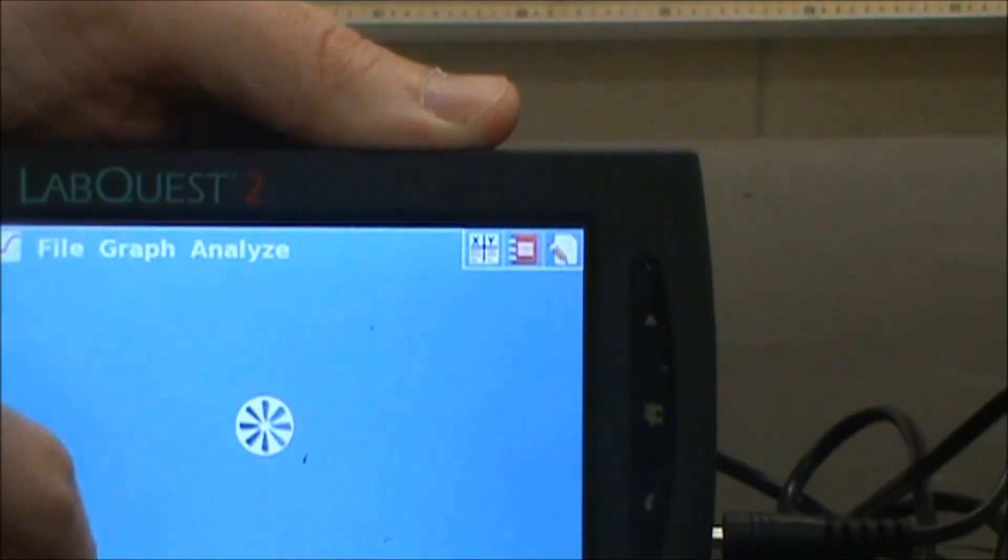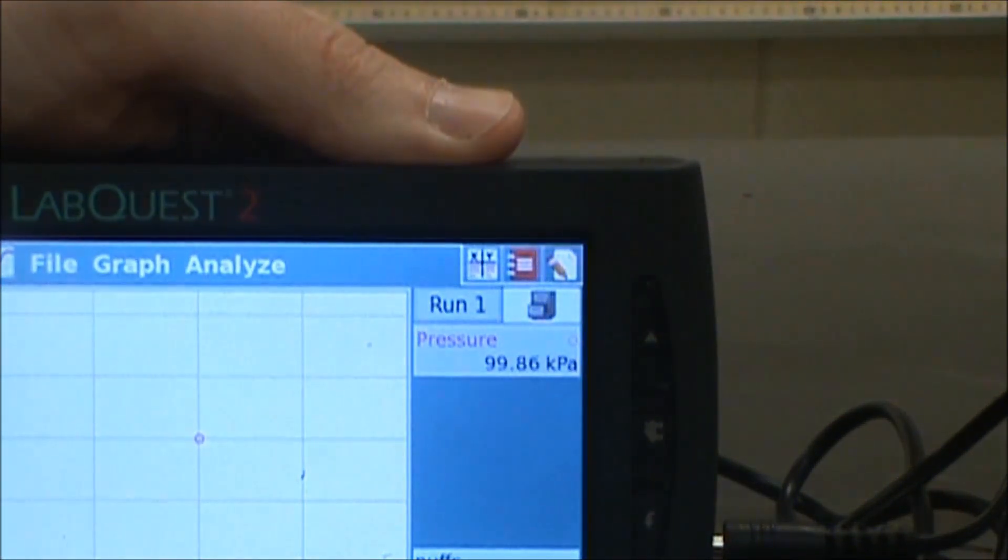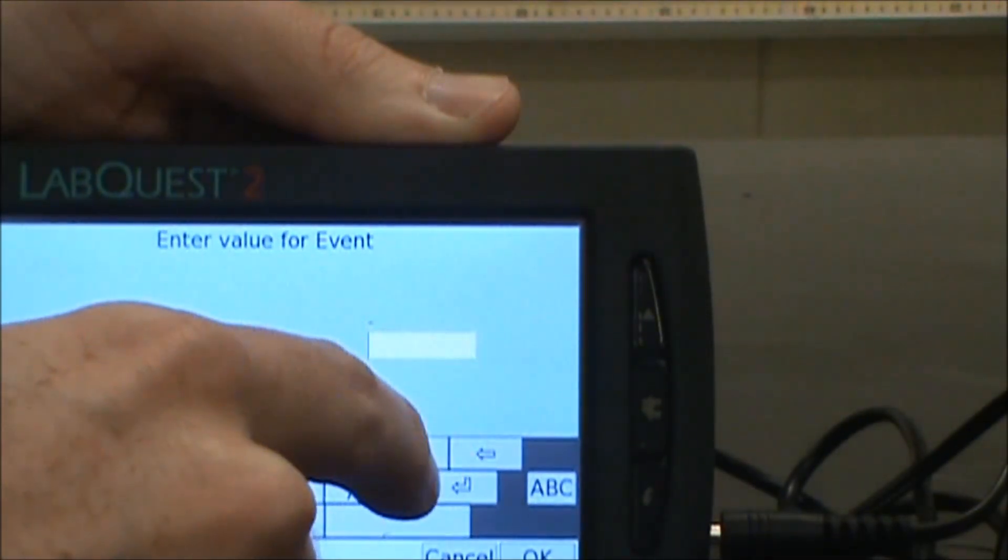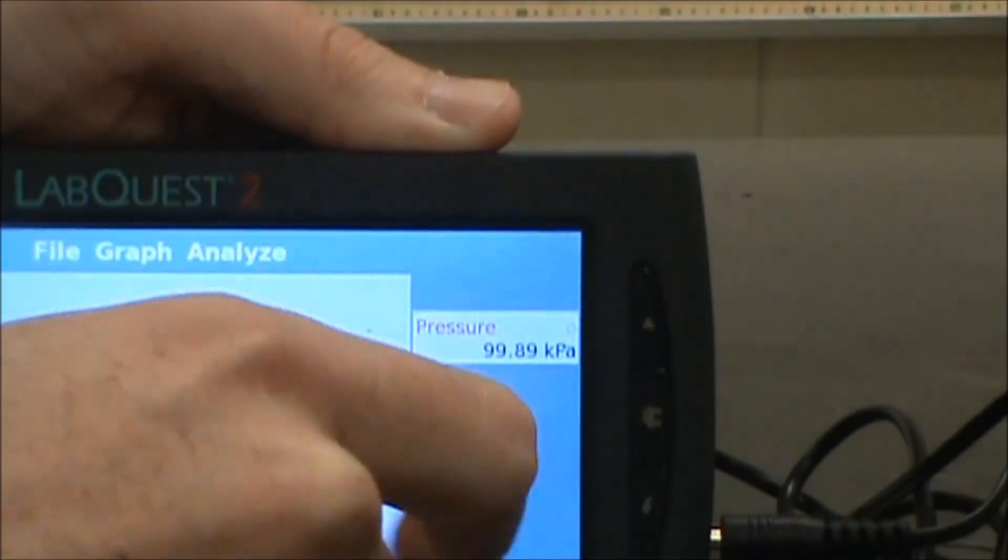I'm going to hit play. That's going to allow me to start tracking what the pressure is as I put more and more things in. To start, this is the starting pressure. I'm going to hit keep. I'm actually going to put in that I've put in zero puffs. OK.